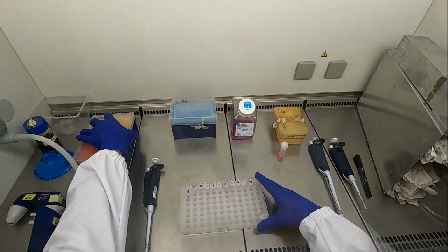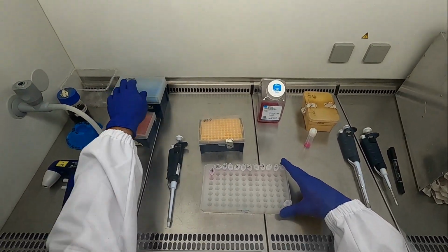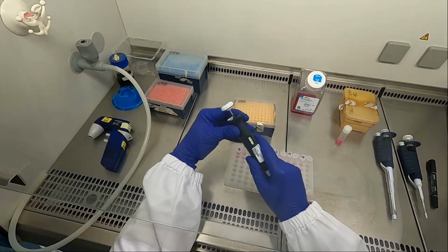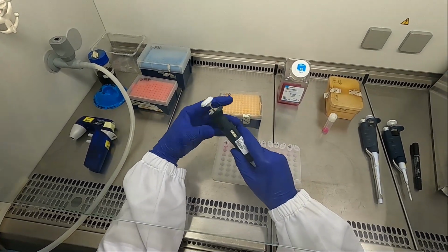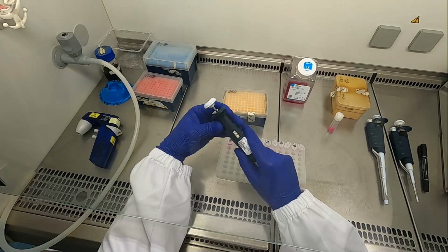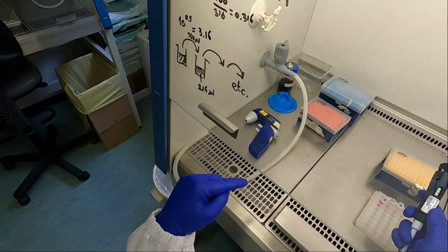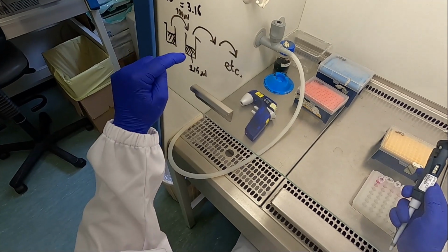So, the moment we've done that, we go back to our P200 and we set it to 100 microliters, because now we're going to do the actual dilutions. The 100 microliters that go from the left tube into the right one.